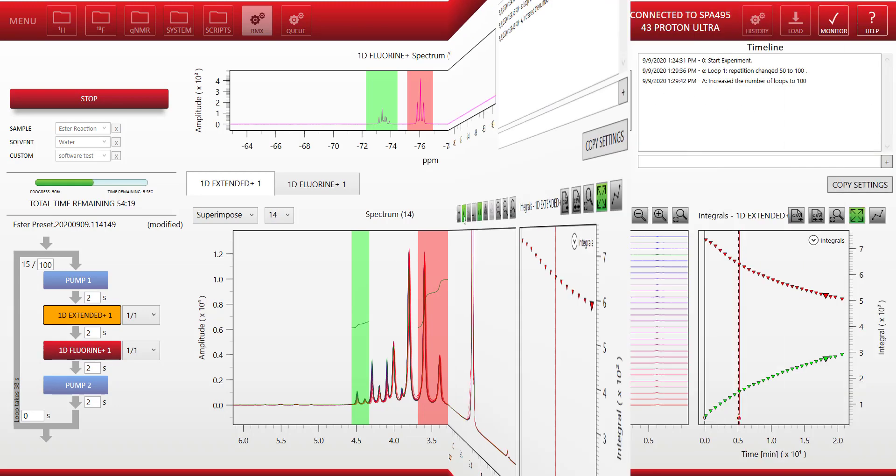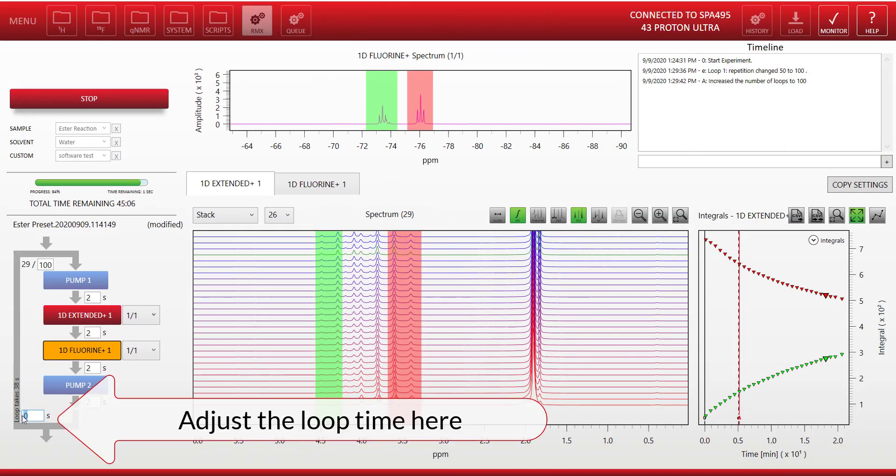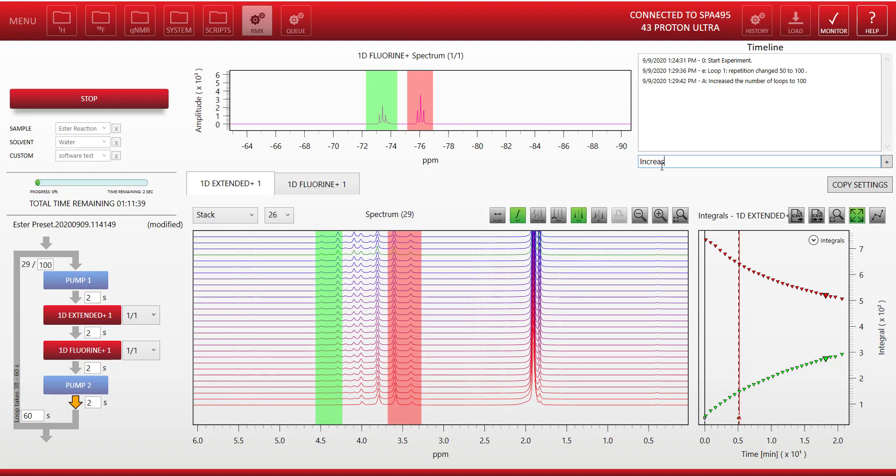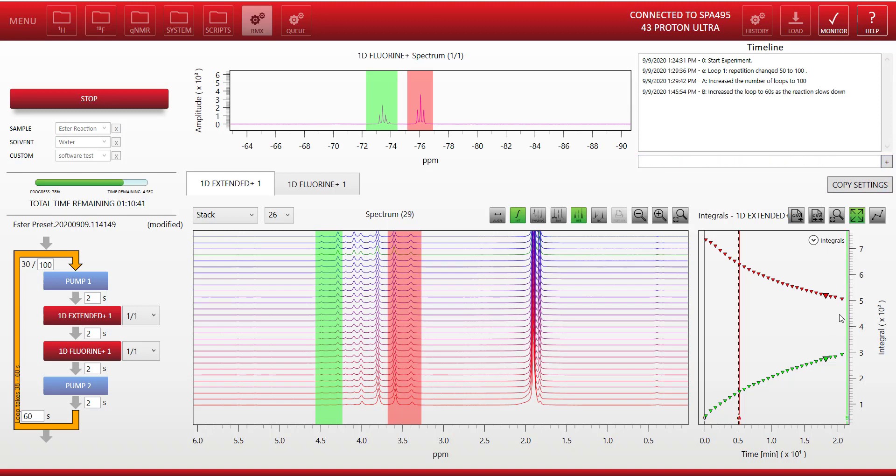Now if we jump forward in time a little bit, we notice the reaction has started to slow down. And I can adjust the duration of the loop so that it will now only run once every 60 seconds. I can make a note that I did this, but remember the system will also record any changes to the parameters into the timeline. So now the reaction isn't changing as fast, I don't need to acquire my spectra quite as often as I did before.